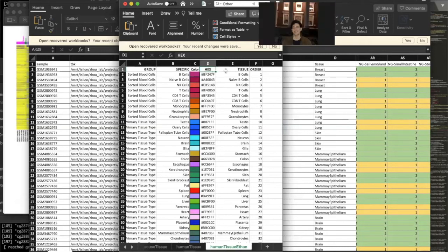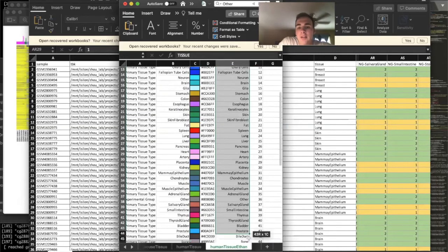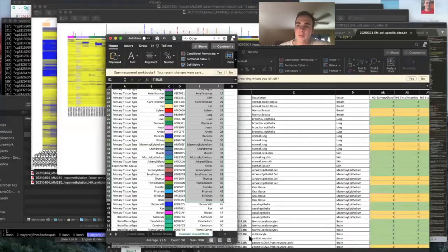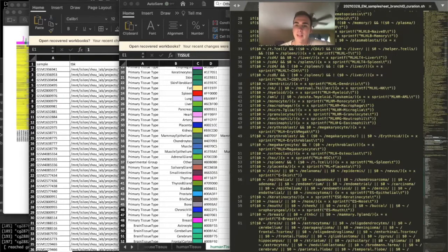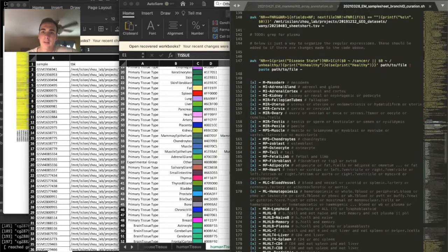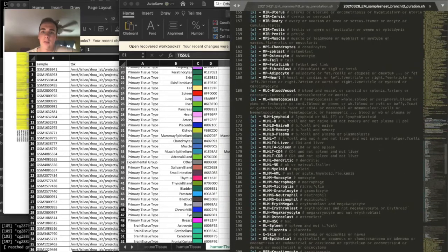But then, yeah, I see. You need these to be harmonized across cell types, across each sample. If Yang's giving that to you, I would look at what I did in awk. Here's how I kept track of it. I defined the branch IDs on the left, and then iteratively went through and looked for which keywords fit in that category.